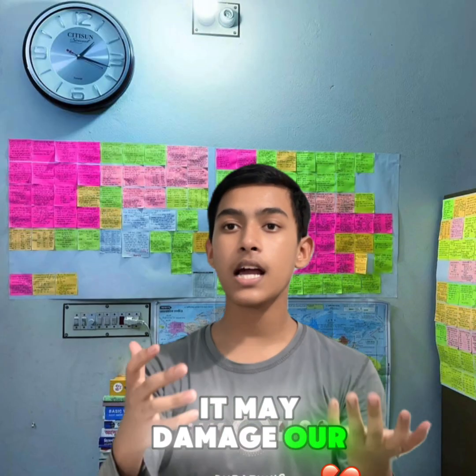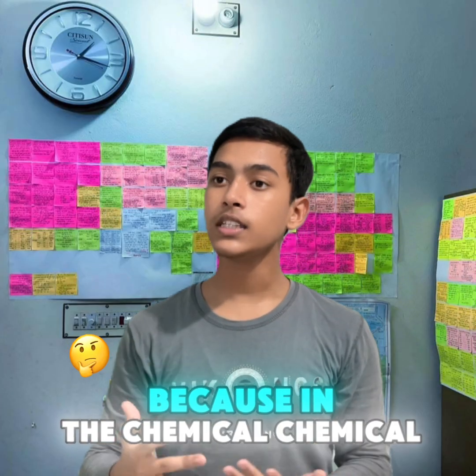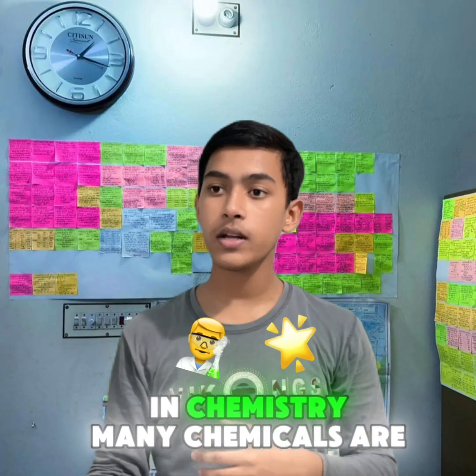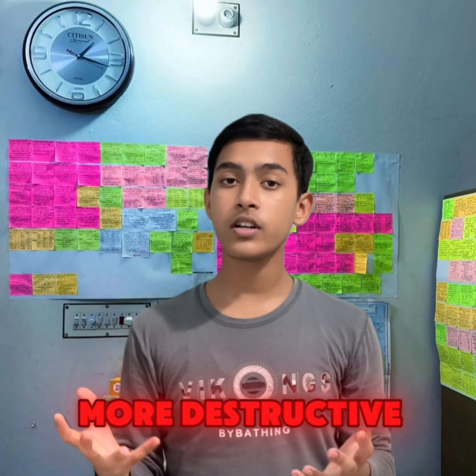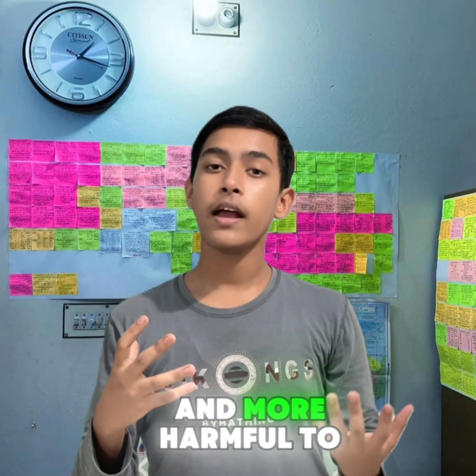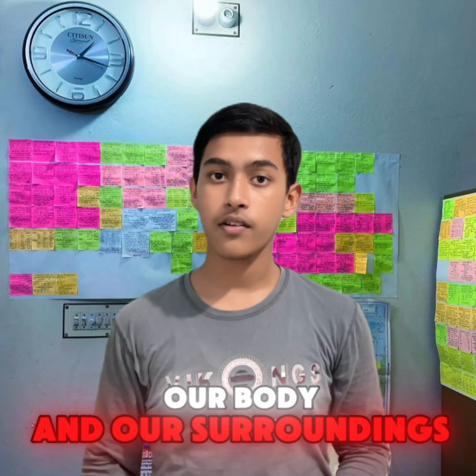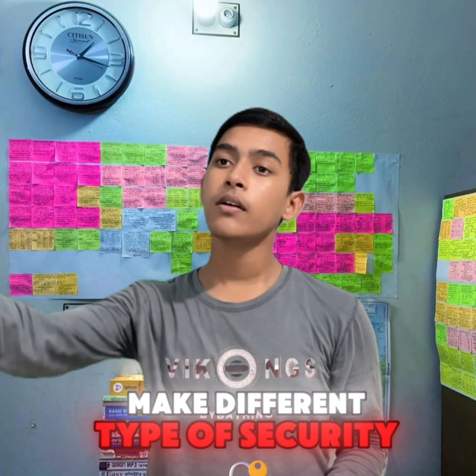It may damage our clothes and our body, because in chemistry many chemicals are destructive and harmful to our body and surroundings. So we have to take different types of safety measures to stay safe.